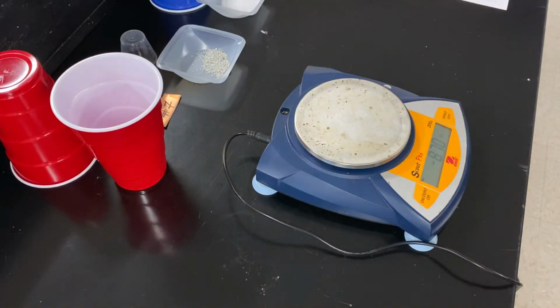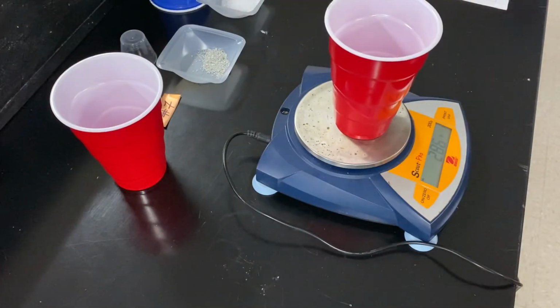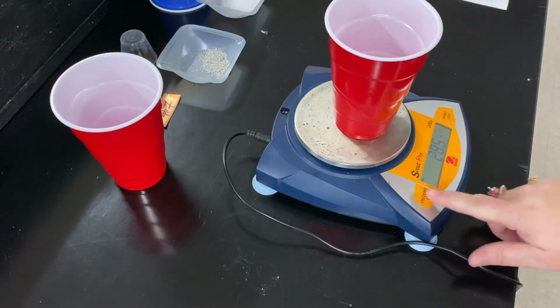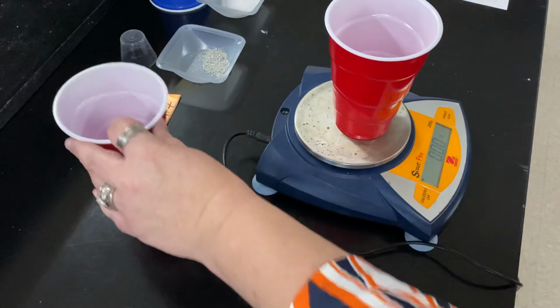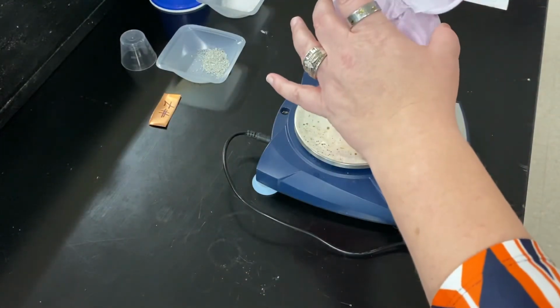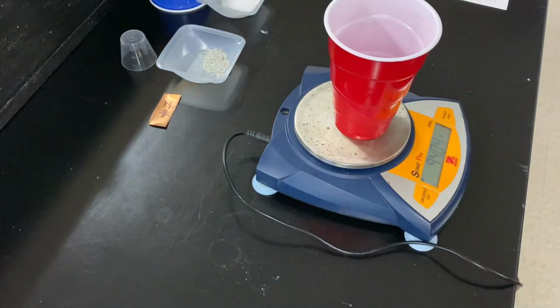Task B is to determine the quantity of molecules of water in a sample. So again, I'm going to put a plastic cup on the balance. I'm going to zero out the plastic cup so it's not considered. And now I'm going to add my sample of water. All right, our sample of water has been added. And the balance reads 94.04 grams.